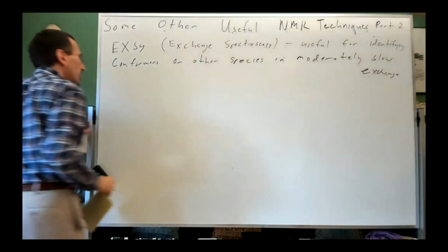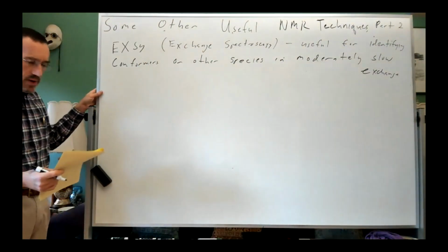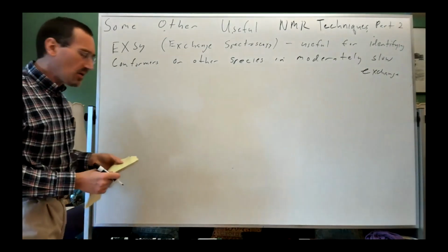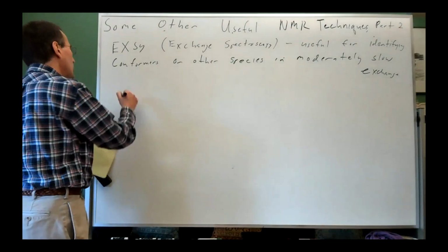And in terms of the operational aspects, it's the same pulse sequence as NOESY or ROESY.